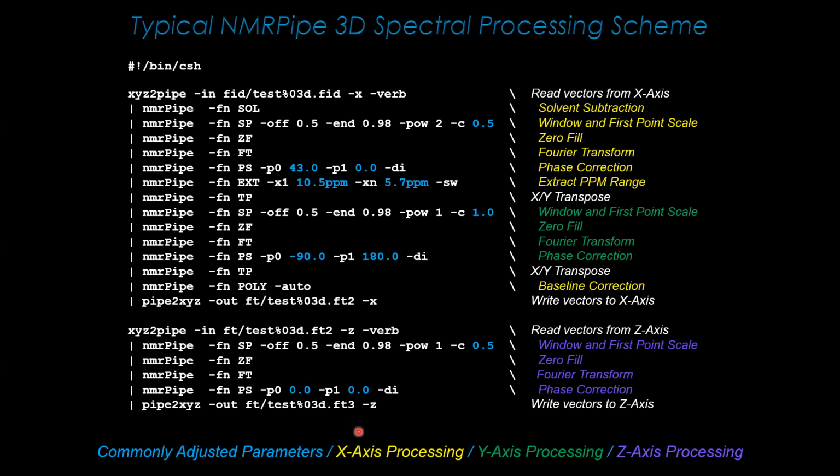On the downside though, if you don't know anything about NMR signal processing and have never written a Unix shell script, this is terrifying, right? It is incredibly terse and cryptic and difficult to understand.